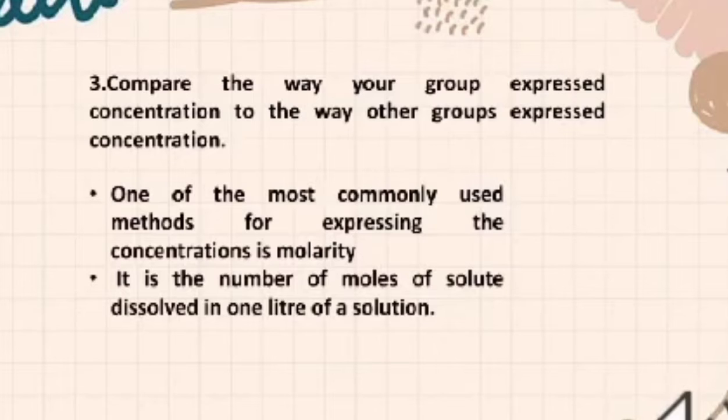Compare the way your group expresses concentration to the way other groups express concentration. The way our group expressed the concentration and other groups is somewhat the same, due to the fact that each group needs to find the molarity and normality of its different solutions that are being assigned to. One of the most commonly used methods for expressing the concentration is molarity. It is the number of moles of solute dissolved in 1 liter of a solution.